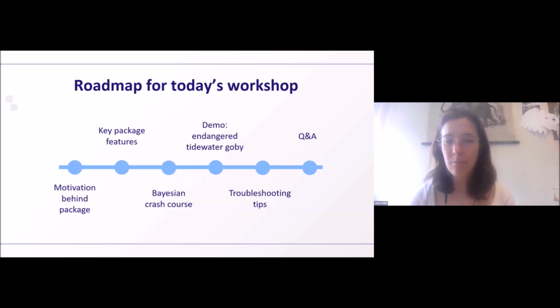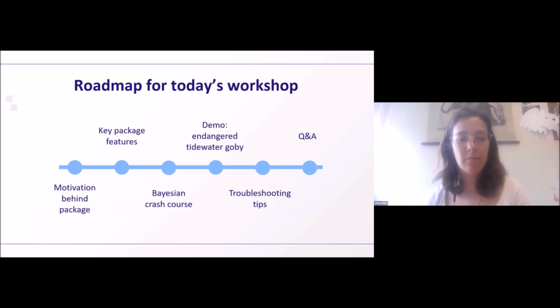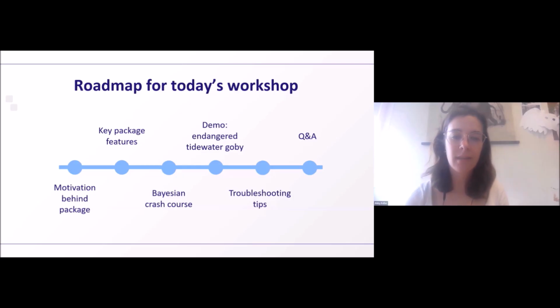I'll go through one example workflow. This uses tidewater goby data from California. And this is just one of two example data sets that are embedded in the package. So you can kind of play around with them as well. And it's really useful for seeing how input data should be structured. I'll finish with some troubleshooting tips and final thoughts. And then if all goes to plan, we'll have some time at the end for Q&A.